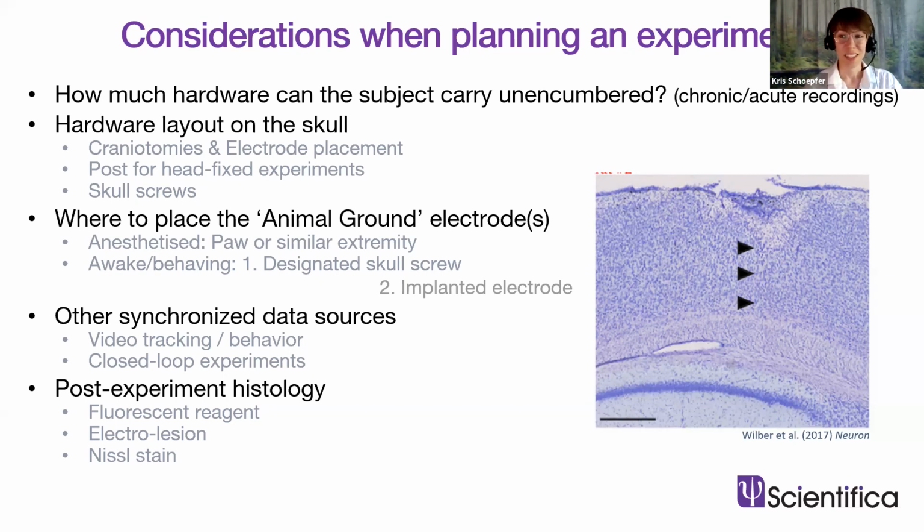So these things are one to think about. And then lastly, after all the recordings are complete and you're ready to terminate the animal and finish that experiment, ideally people would really like to check the histology, right? See where your probe has gone in the tissue. And there are different ways to do this.